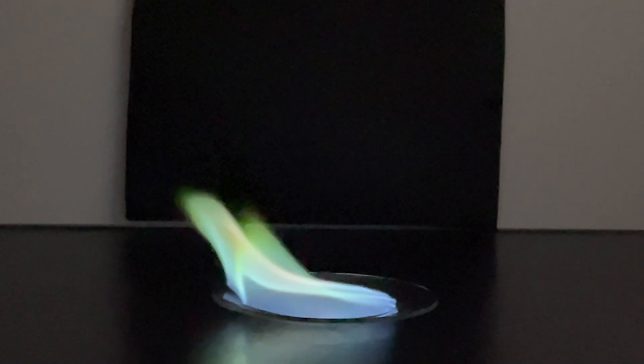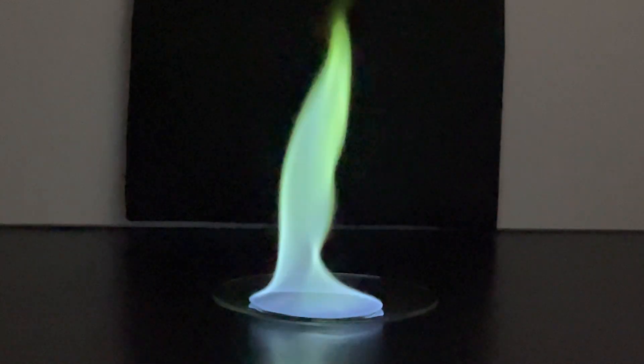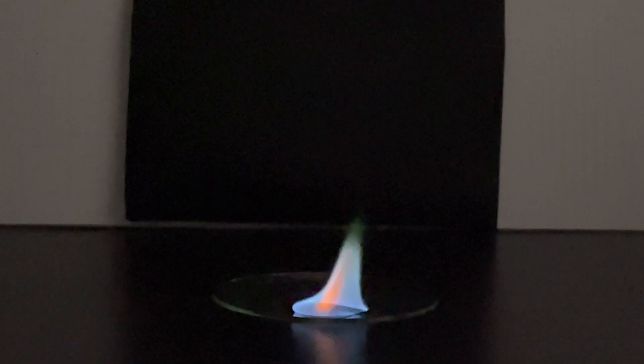Wow. That's beautiful. Holy sh**, dude. That's better than I thought. And it's blue too, oh my god. Look at this. See the flame disappearing? Absolutely extravagant. Amazing.